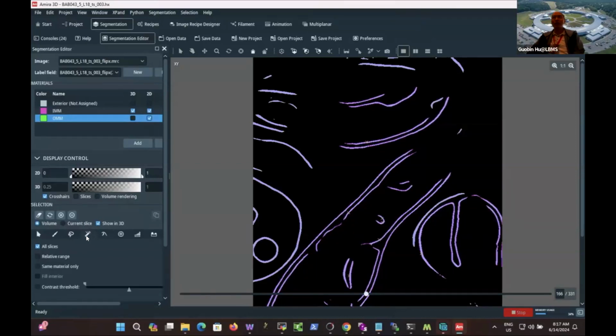Compared to cryo-FIB milling? Well, with FIB milling, what's really cool is how automated it's become. It's definitely very time intensive, but the last data set I milled, which was probably in October, because I'm starting a new lab and that means I don't get to do fun stuff for a moment. This is my fun activity now. I am able to mill maybe 30 lamellae in a day, an overnight session. And that's fast, but it's because I make smaller lamellae. And then on the cryo-EM from those 30 lamellae, I might be able to collect 150 tomograms in a day. So, 2 days of work.